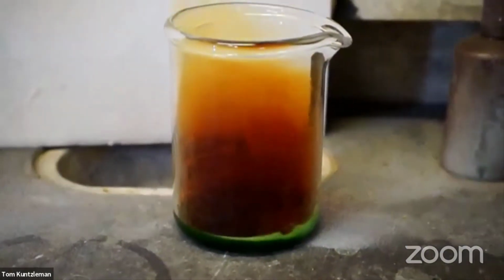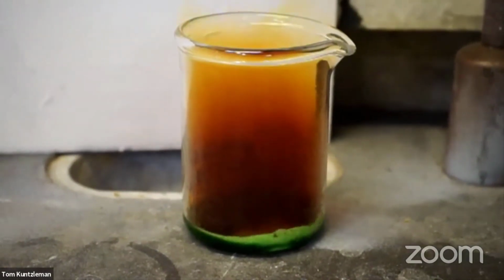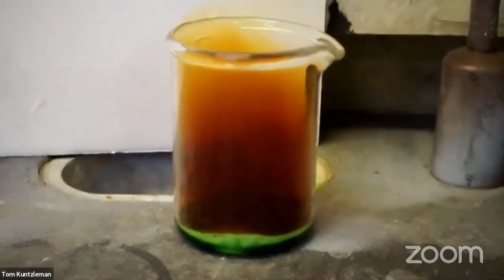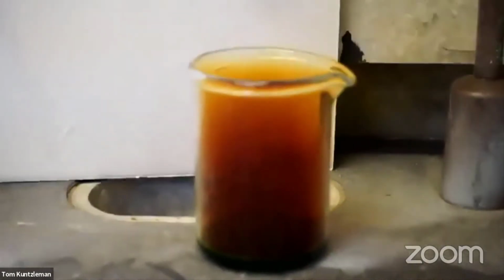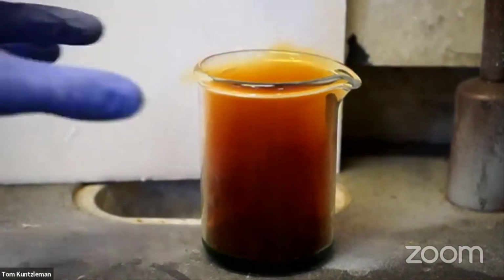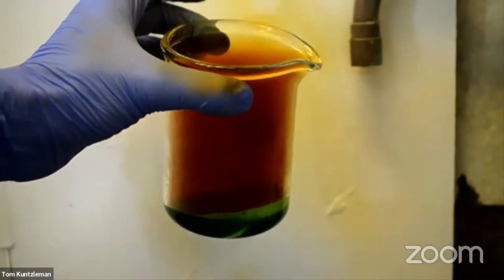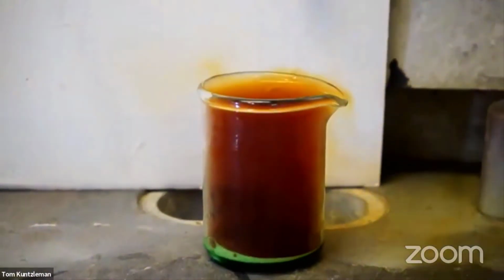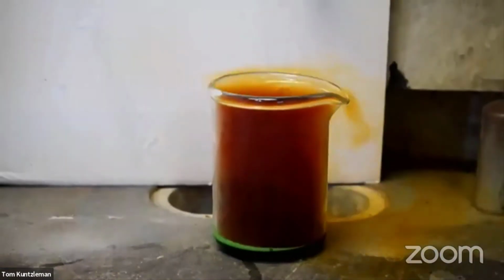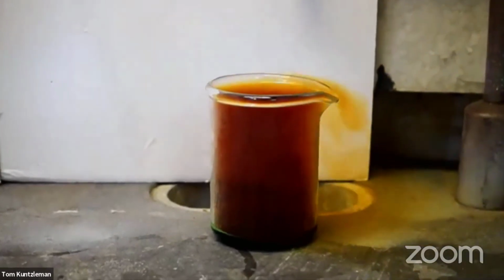I imagine what's happening, if we think about what we've learned so far today, is that the nitric acid is reacting with the copper in the penny, and it's changing it from a metal to a compound. And I kind of guessed that because I see a little bit of green color there, a little green-blue color. You can see the gas coming off too. Good thing we got the hood at work. When you're doing chemistry, anytime you see a colored gas, that's not something you want to be inhaling. So that's why we're doing this particular experiment in the hood.